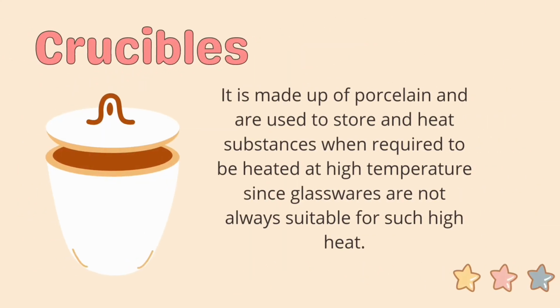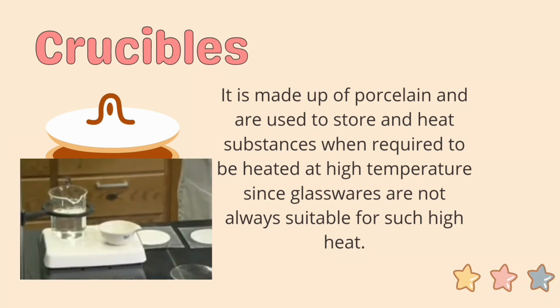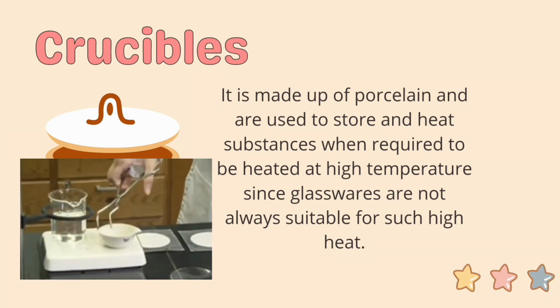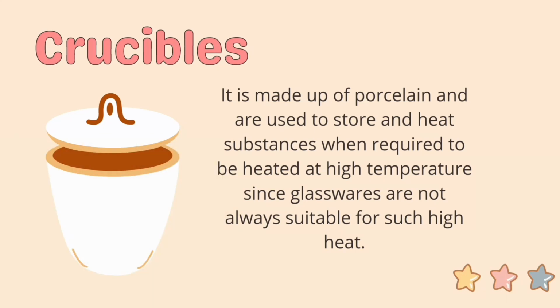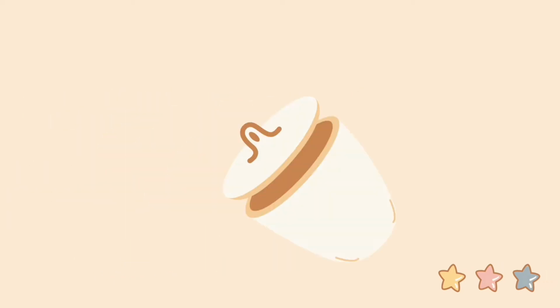Crucibles are made up of porcelain and are used to store and heat substances when required to be heated at high temperatures, since glasswares are not always suitable for such high heat.